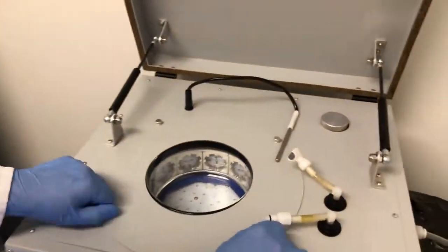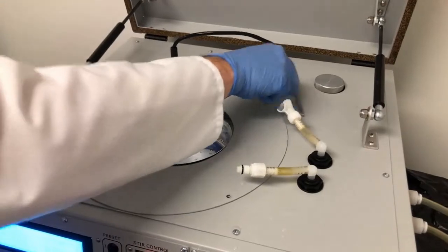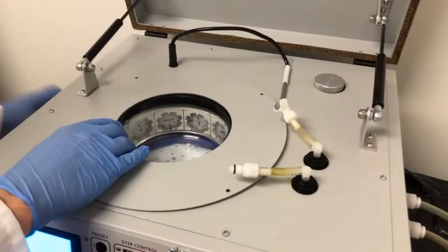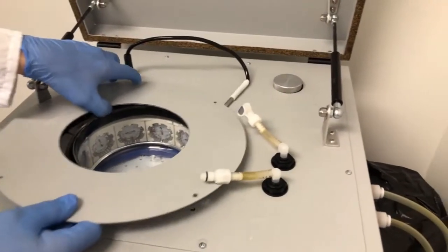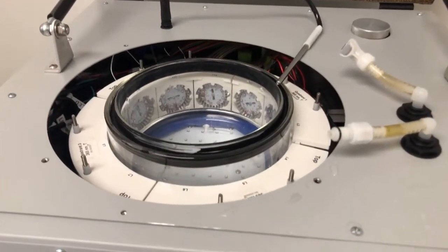If you want to access the light modules, remove the thumb screws on the plate surrounding the reaction chamber. Once the plate is removed, it's easy to lift the reaction chamber out if it needs cleaning, or to get better access to the LED modules.